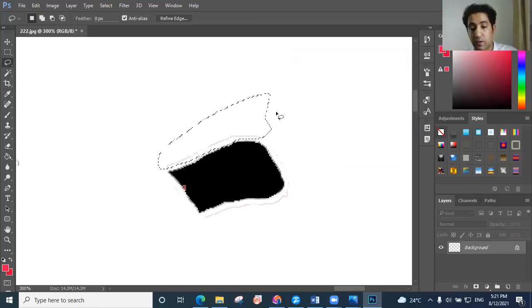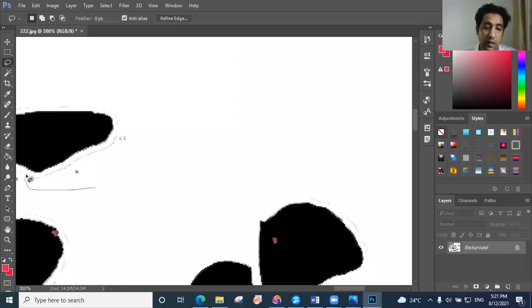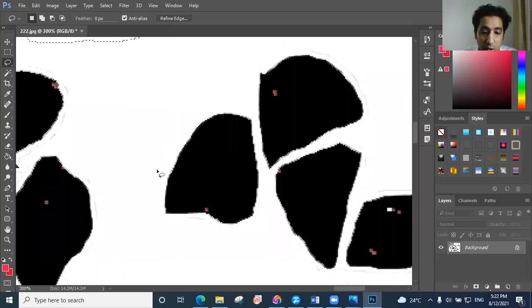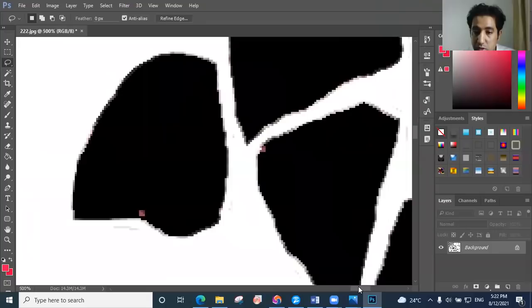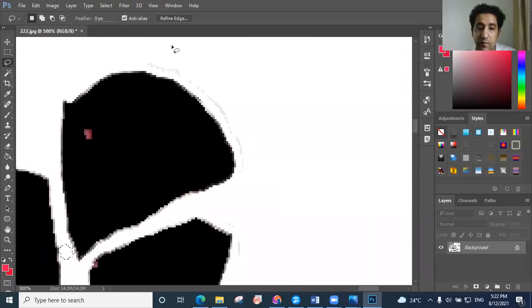This line that is okay if you don't clean it, no problem. The only thing you clean is the dots between the grains on the pictures here. Between the grain, be careful. You need to make it bigger to see if there's any dots, because it will be calculated as one grain and it's nothing. You already cleaned, and make sure here. All right, delete. Okay.